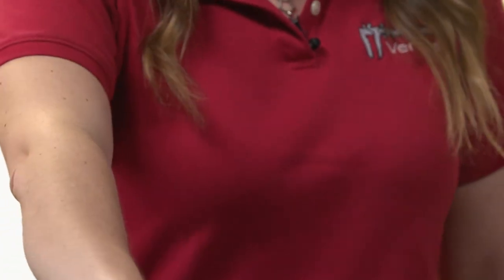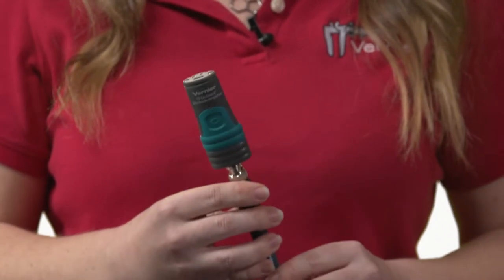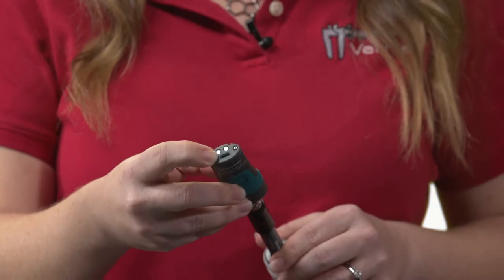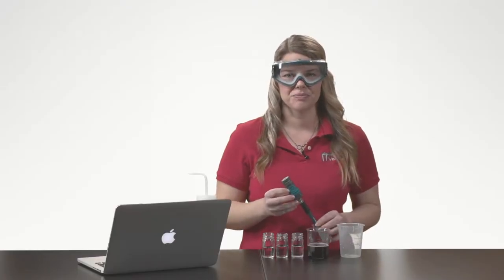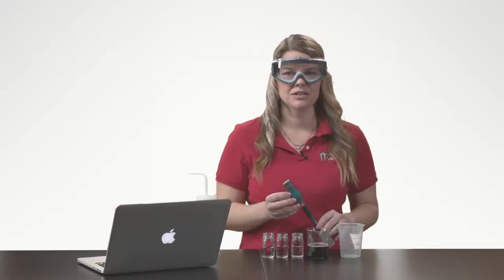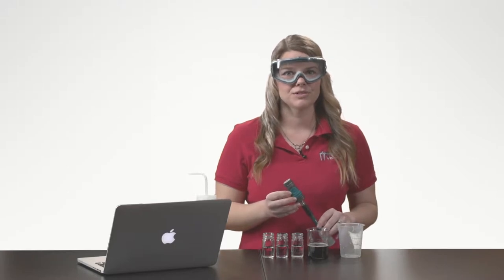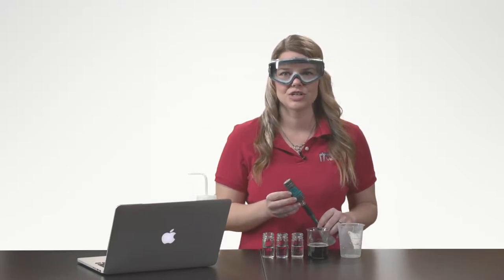The GoDirect pH sensor can be connected via USB or Bluetooth to your platform. Your platform can be a Chromebook, Mac computer, Windows computer, iOS or Android device.